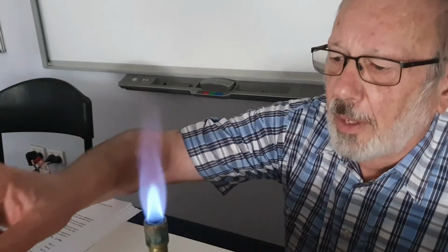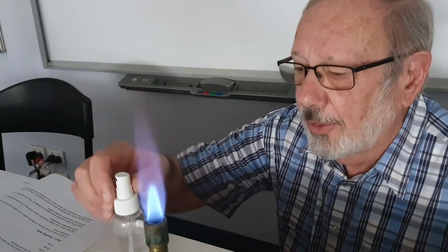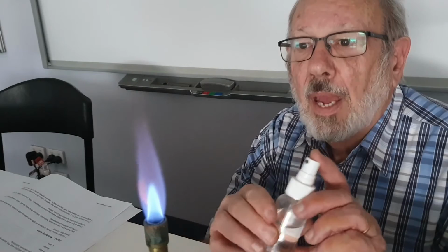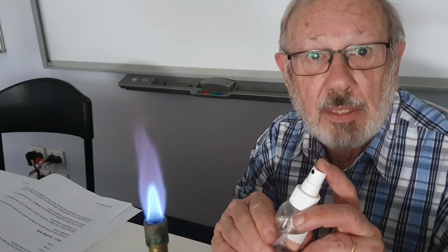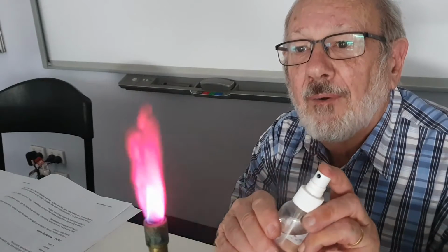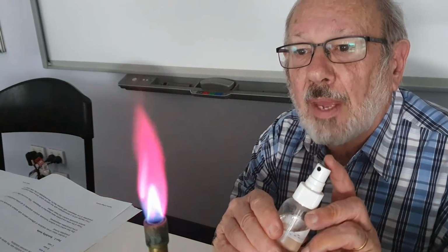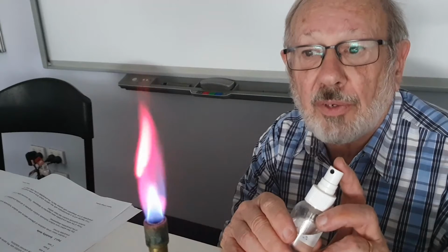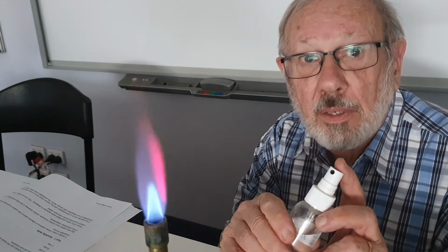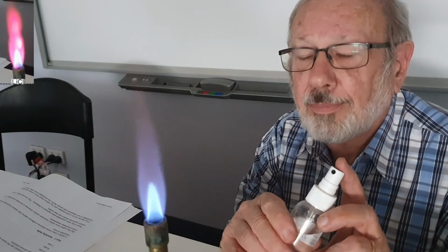The first one that we're going to have a look at is lithium chloride, and its formula is LiCl. And the colour there that you can see is bright red, even crimson.